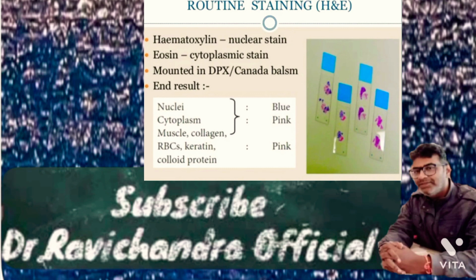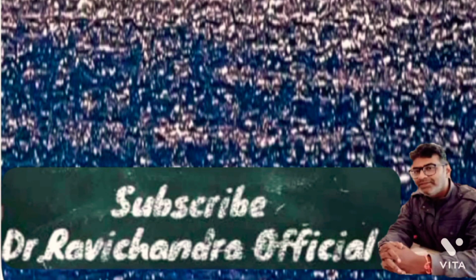Microscopic examination. Stained slides are then examined by a pathologist, and the pathologist should write the report in a register. The last step, including entering the case into a computer database and printing the labels, is signing off. Then label the slide and deliver the book of the slide to the assigned pathologist.